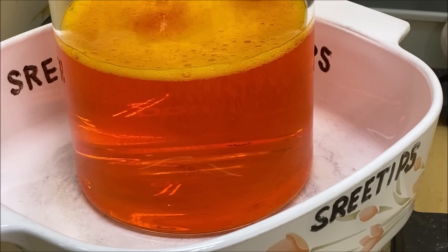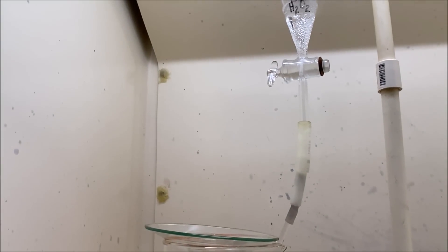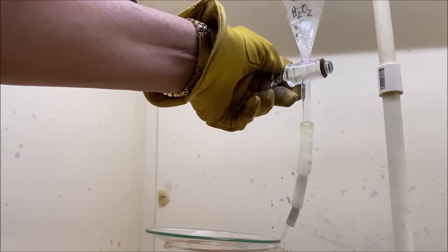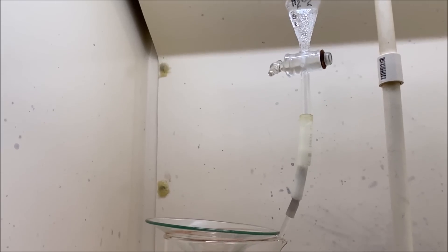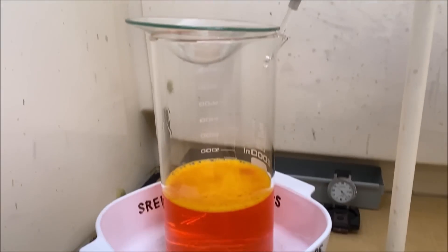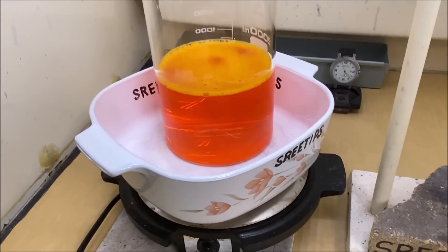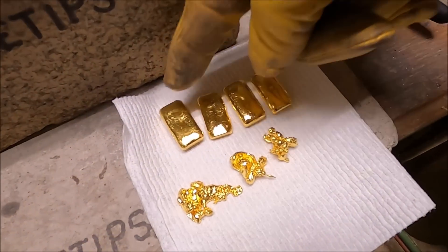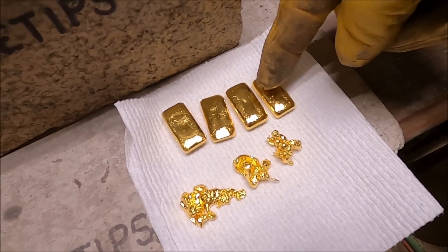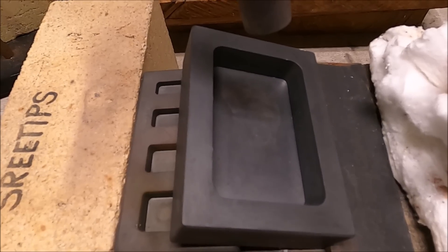I've got just about all the gold to go into solution now. So what we'll do is turn off our hydrogen peroxide drip and go ahead and turn off the heat, and let this cool down.